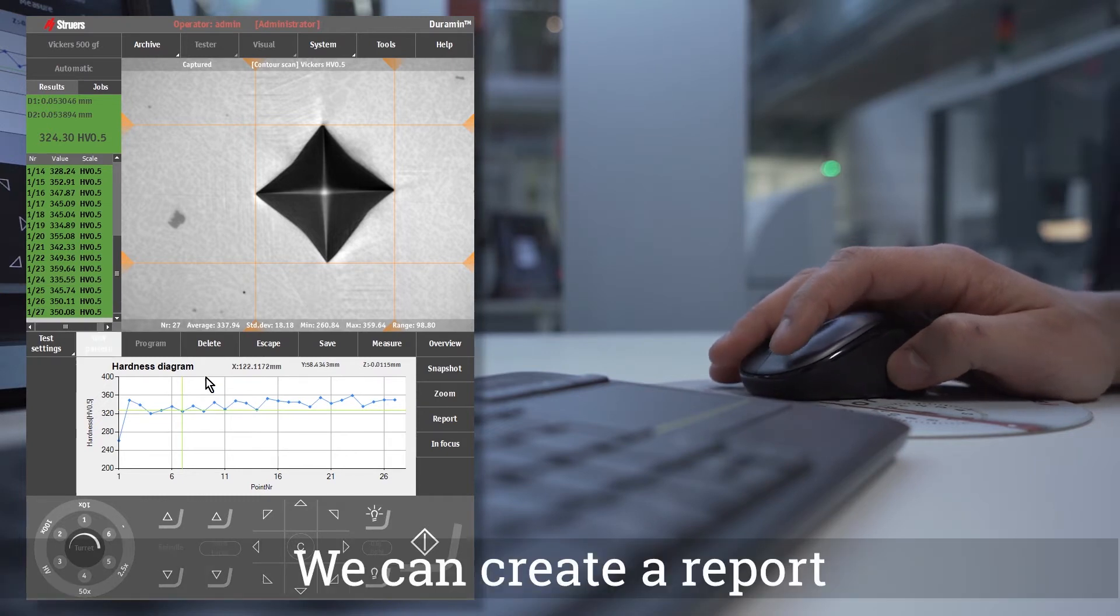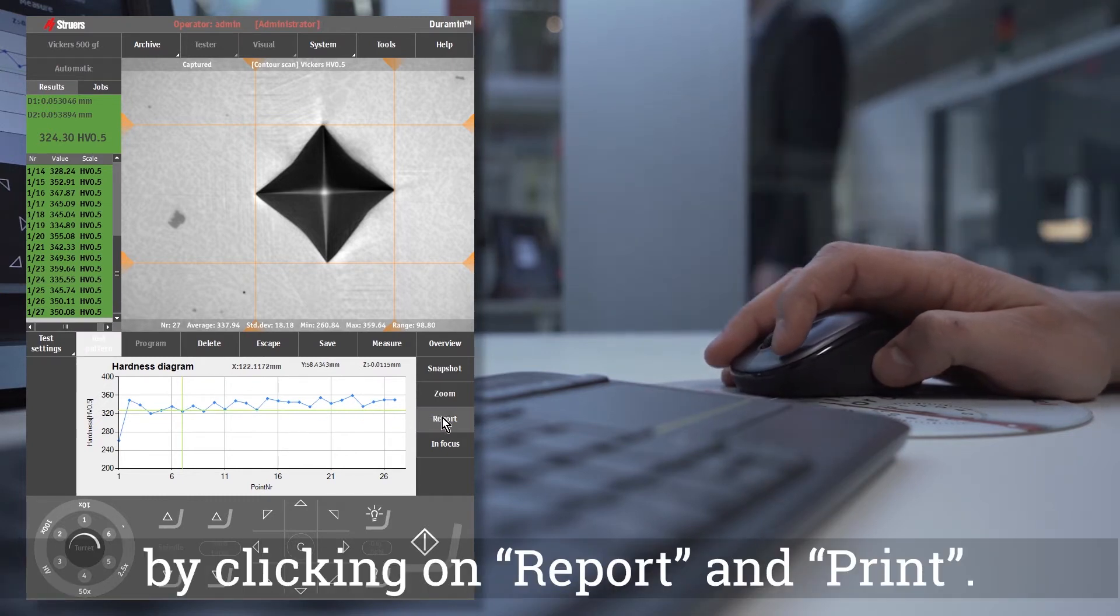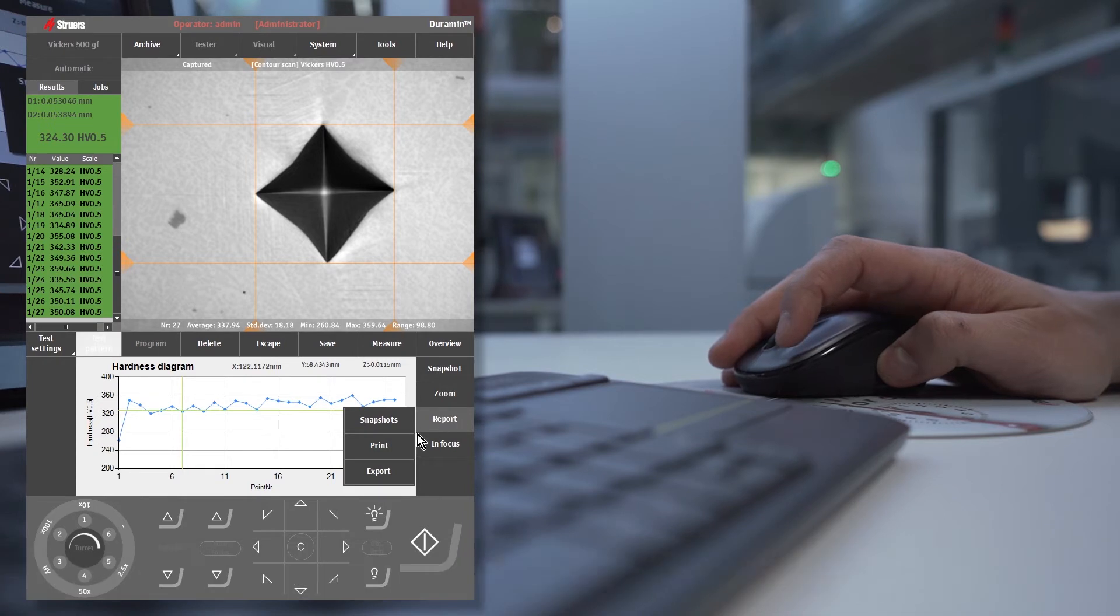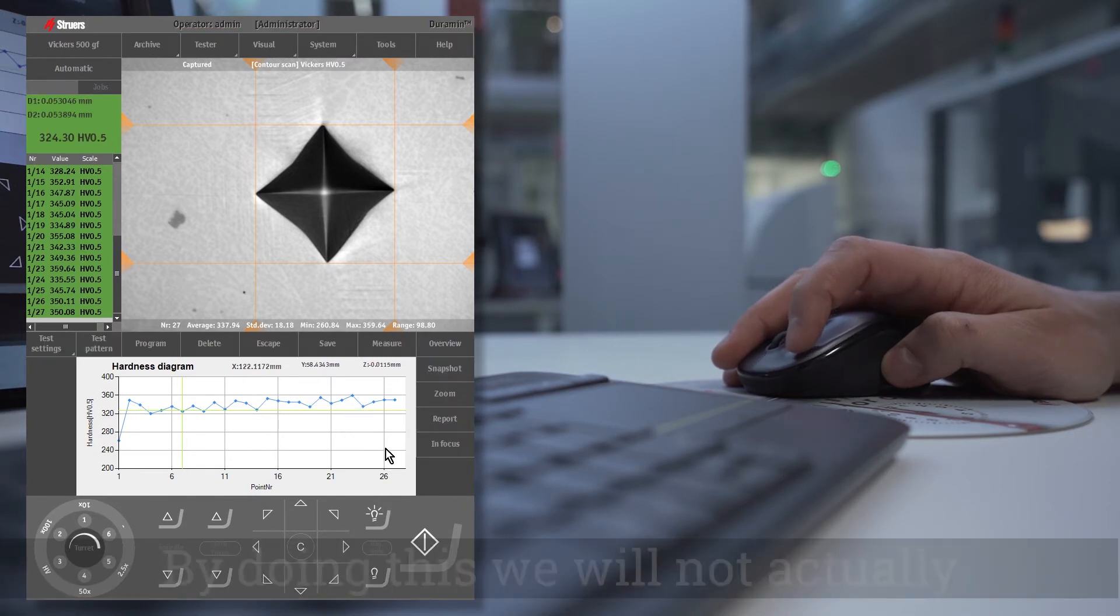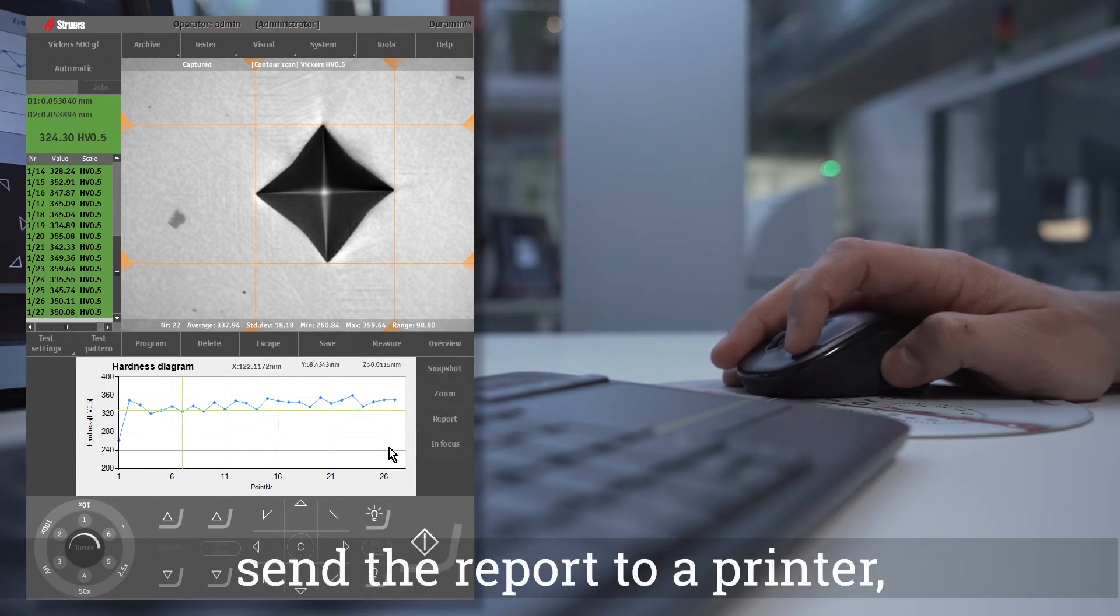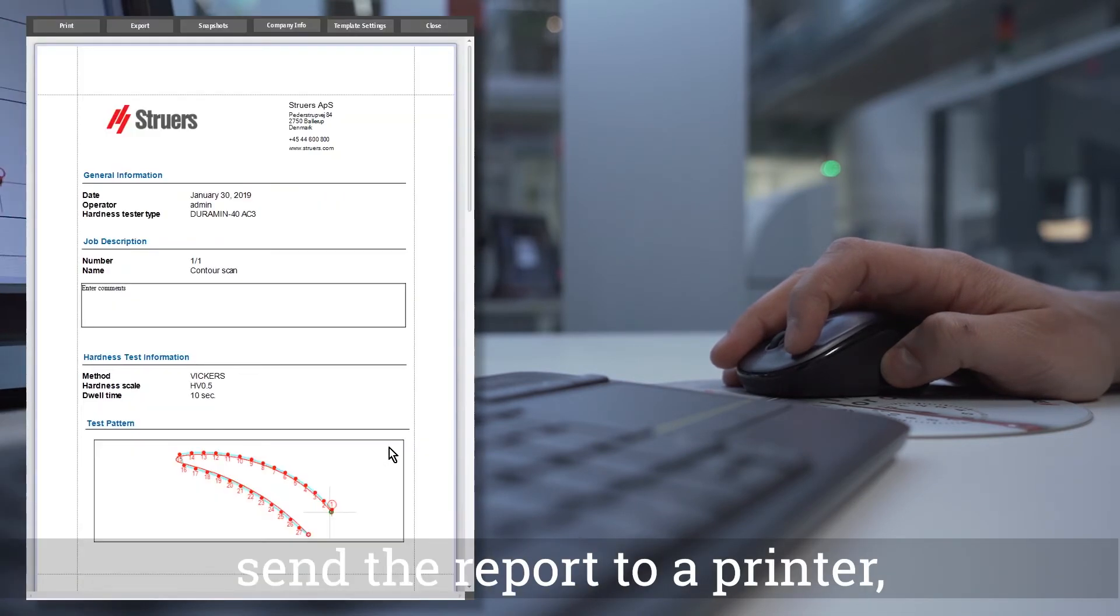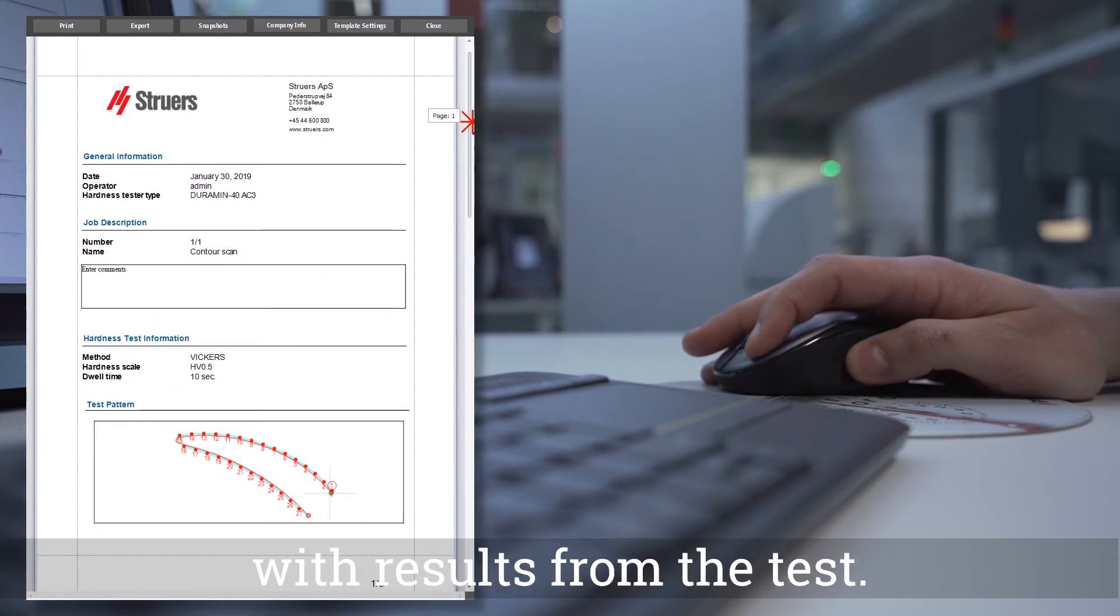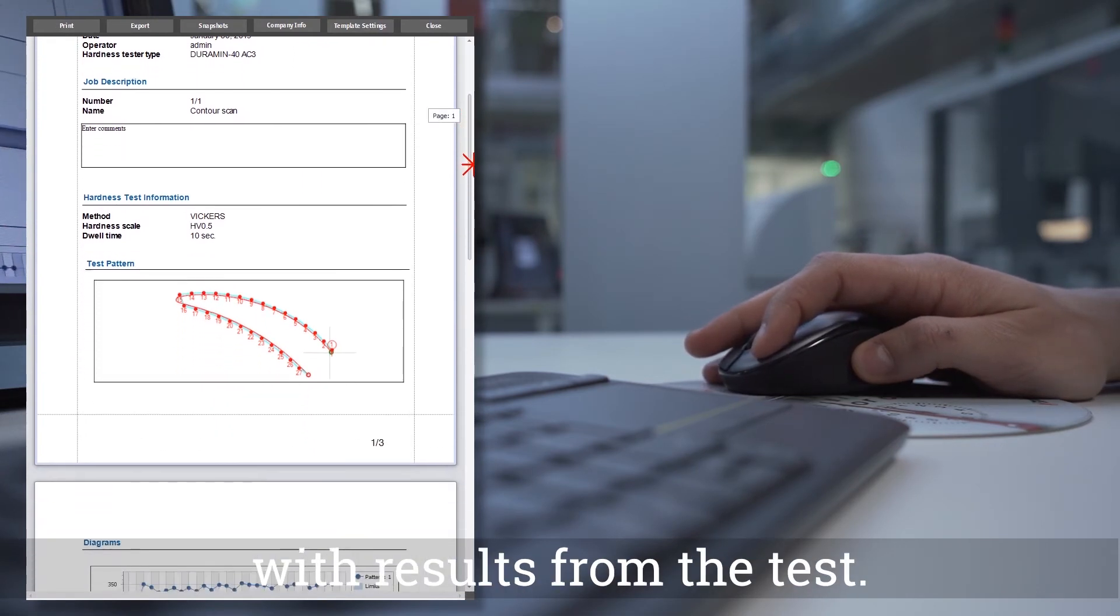We can create a report by clicking on report and print. By doing this we will not actually send the report to a printer, but only generate a report with results from the test.